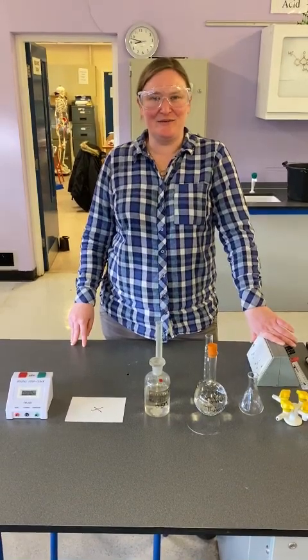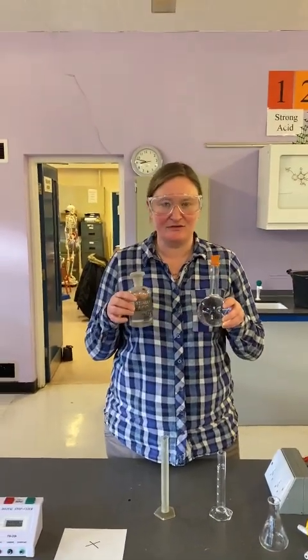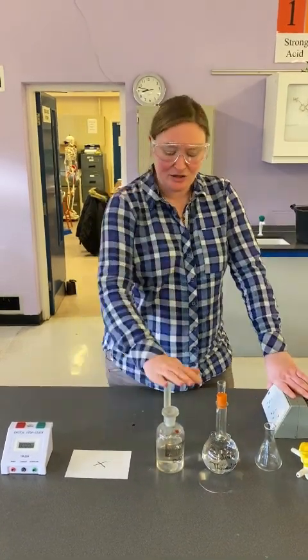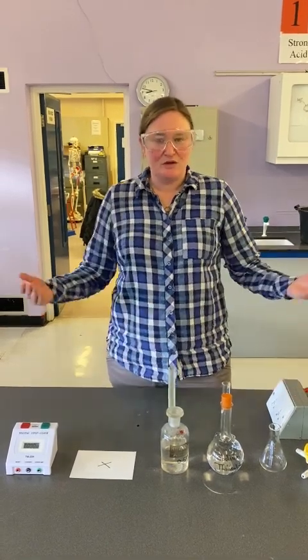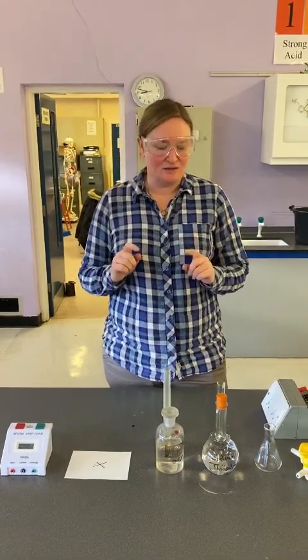Hello Year 11, we're going to do an experiment today with these two chemicals here. This is sodium thiosulfate and hydrochloric acid. And we're going to change one of the variables. The variable that we're going to change today is the temperature of the two different liquids that we're going to use. So, how will we know when a reaction has happened? We're not measuring volume of gas given off this time. You will see what we're going to do.